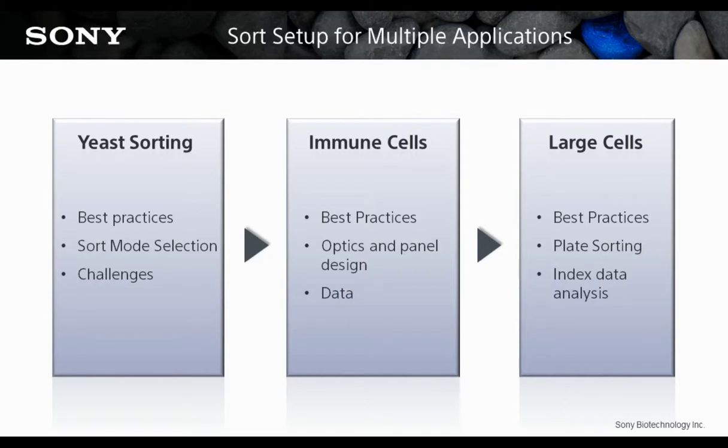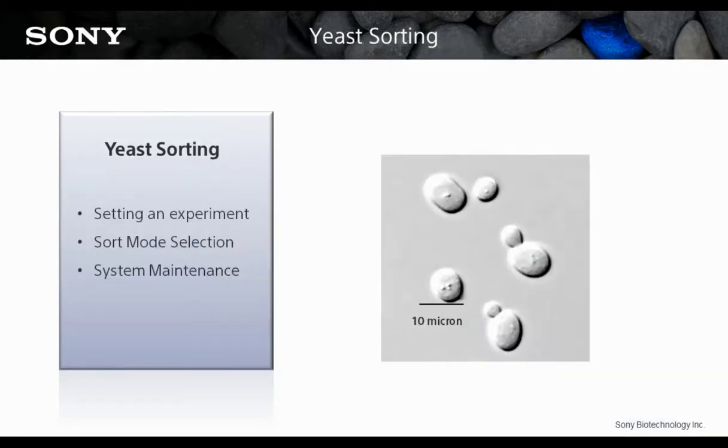I will continue by looking in more detail at a few different applications a user might encounter, all in the same day of sorting on an instrument. We'll cover yeast sorting and cleaning, followed by some high-parameter panel data, and finish up by looking at plate sorting of large cells.